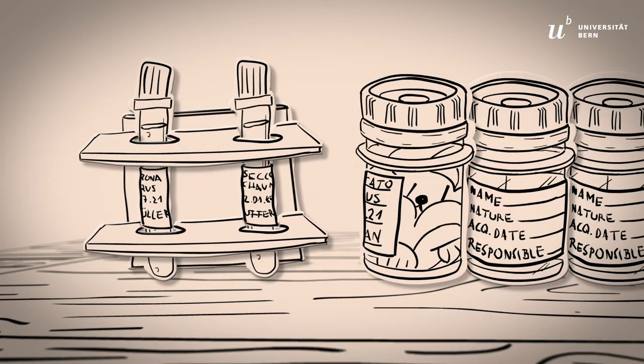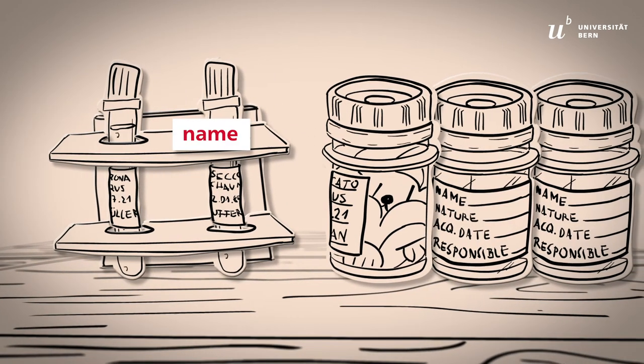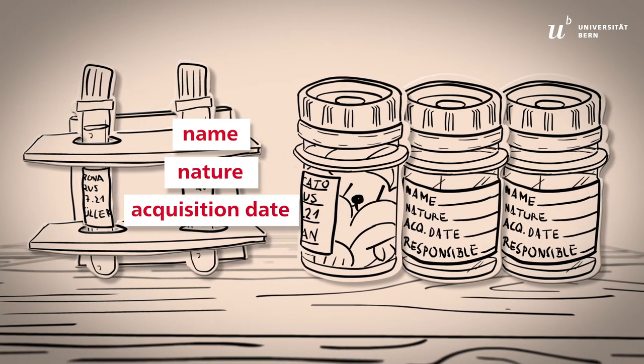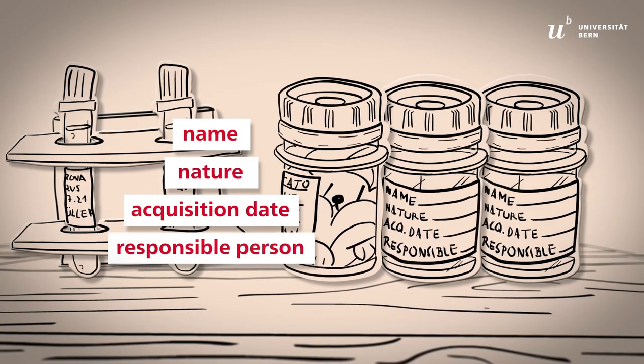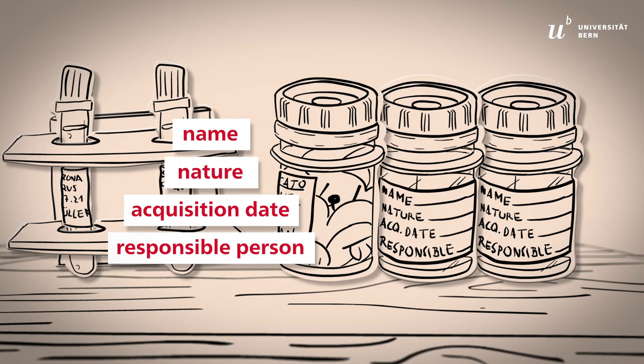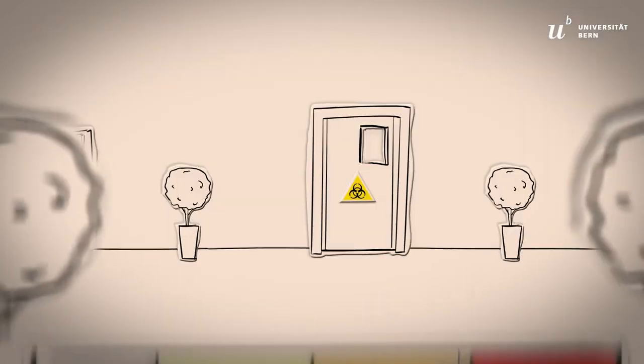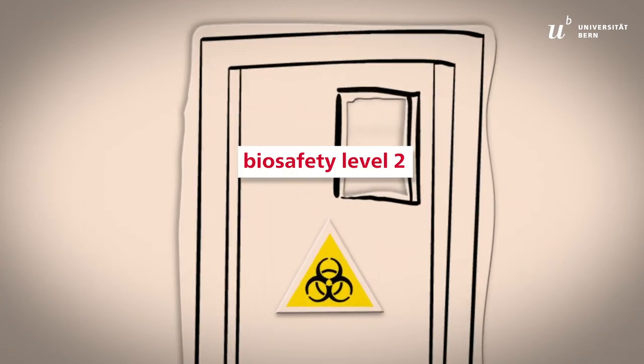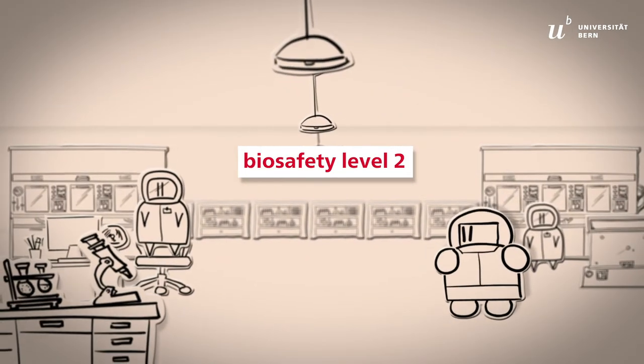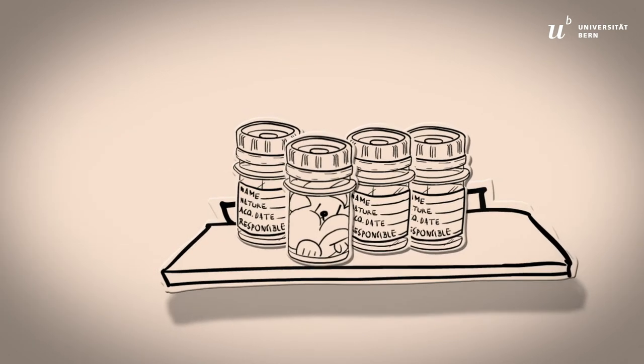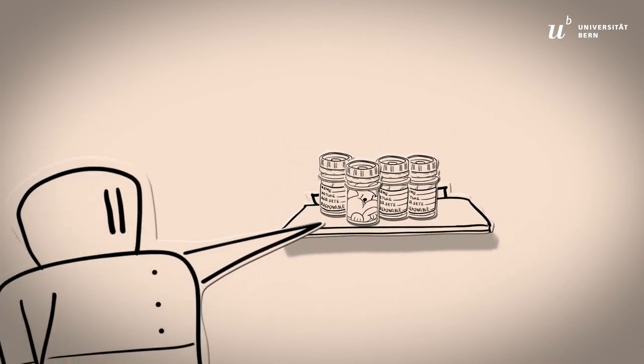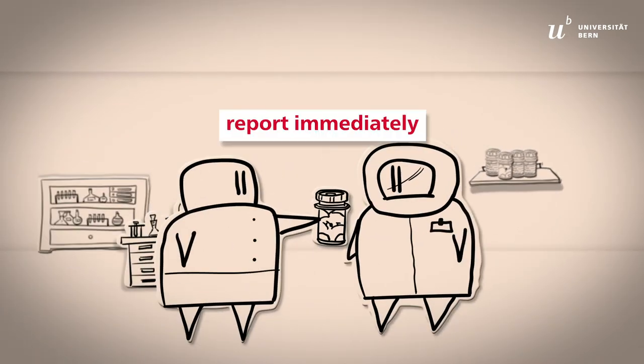The containers must always be labeled with the name, the nature, and the acquisition date of the agent, as well as the name of the person responsible. Organisms in risk group 2 or higher must be stored in a laboratory of biosafety level 2 or higher. Unlabeled containers must not be used and must be reported immediately to the biosafety officer.